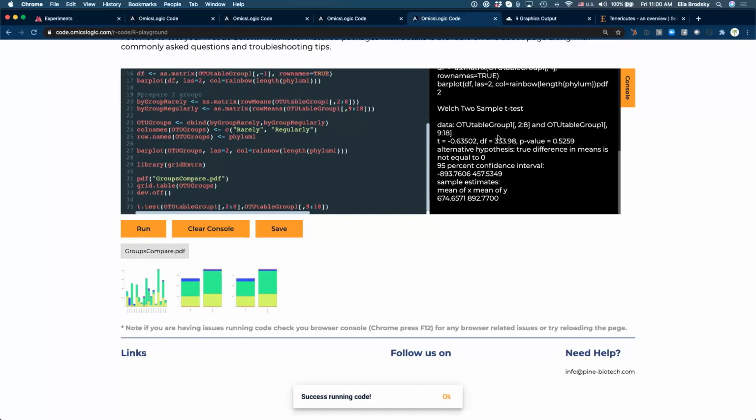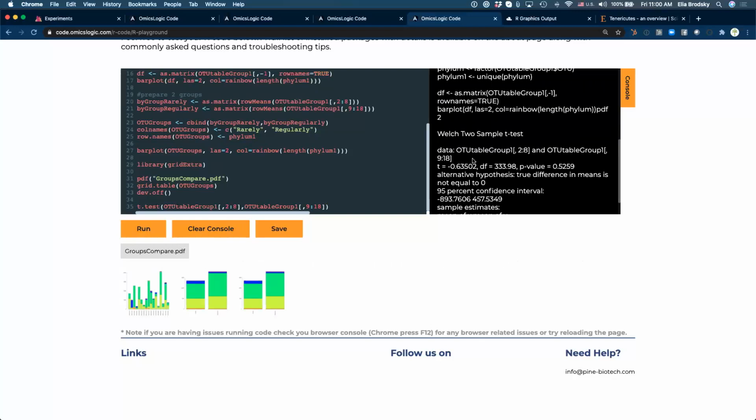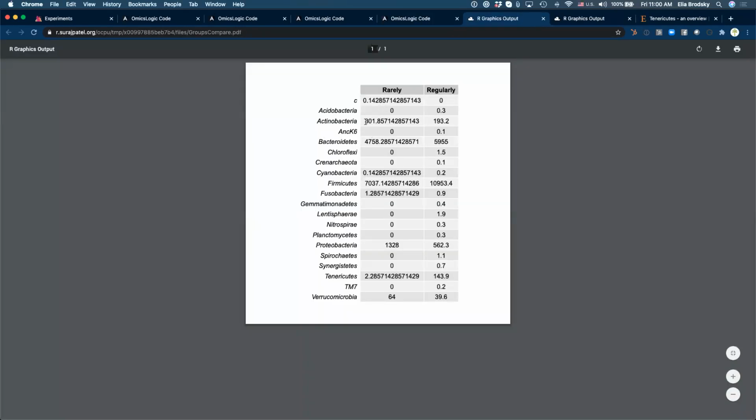Okay, so here we have our output. And so we actually probably need to do this, this is probably just for the first row, so we have to do it for all of the rows. Let's take row 5.